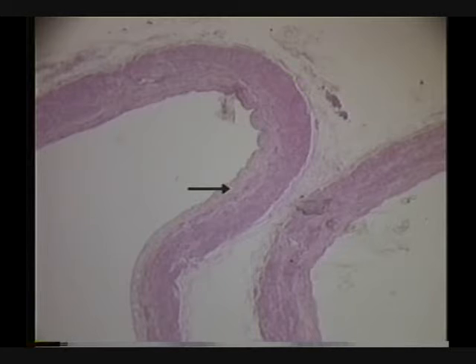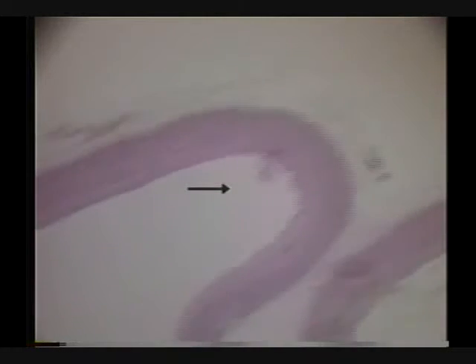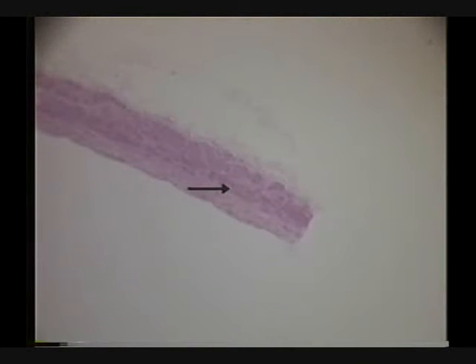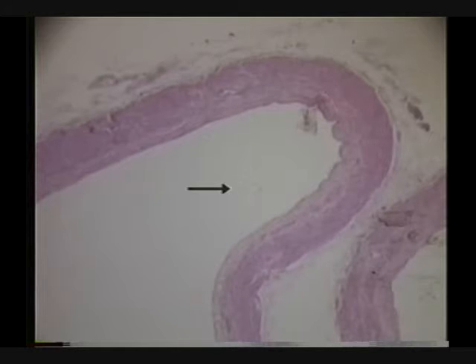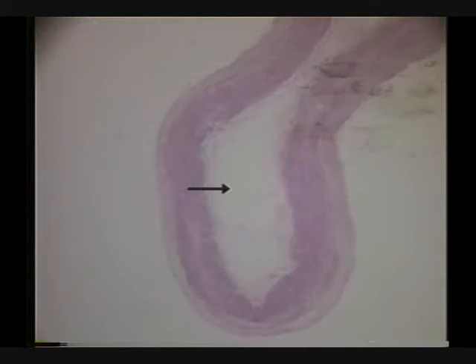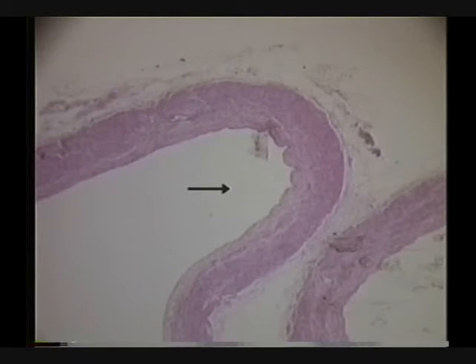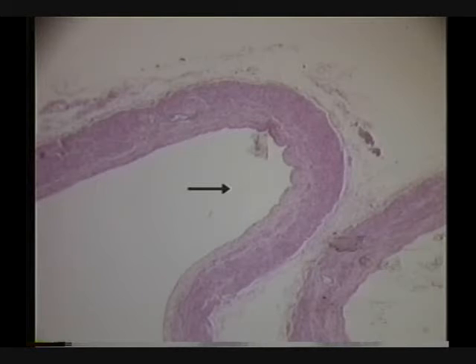This is a hard one to identify unless you've looked at it before. I'm on the lowest power, and it's cut off - not complete because it's part of this structure. It winds around and goes over to where it's cut off again. Normally it would be continuous as a circle. The pointer is now in the lumen - this is outside, this is in the lumen. So what structure is this? It's a vein. I've seen it before so I know it's a vein, but it doesn't jump out like one in situ in the tissues on the last slide.